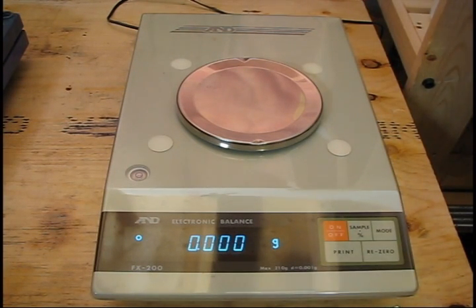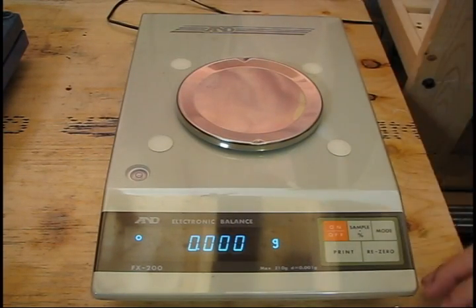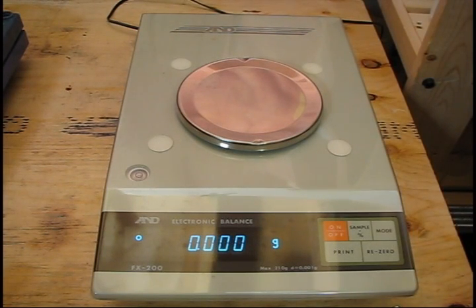This is why most good analytical balances have a glass box surrounding this area with sliding doors, so that you can actually weigh your sample without any wind or vibration disturbing it. This one doesn't — I'll have to try and build one for it, but still, for the price I got it at, it was worth it. Another common procedure is to weigh an empty vial and then weigh a full vial and take the difference of the mass. Some people may have done this by hand before electronic balances, but today all balances can do this automatically.